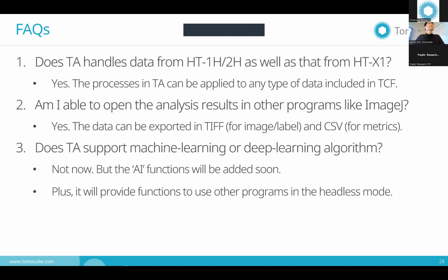And then the lipid volume, for example, that is displayed in the analysis result. Is that an approximation of the whole rugby-shaped volume, or is it simply the sphere formula calculating from the radius? Oh, it's a real number. It's a real number of voxels. So the size of the lipid is calculated from the volume. It's the ESD, which is the equivalent sphere diameter. So the number is given in that way.